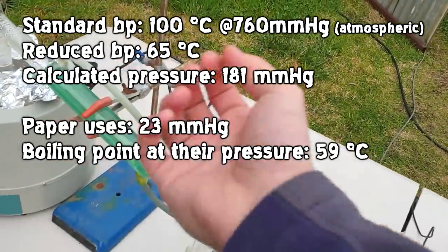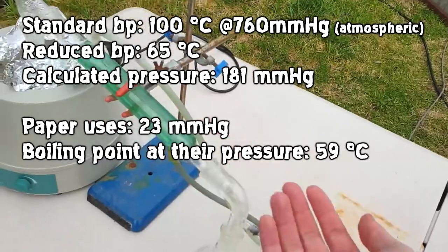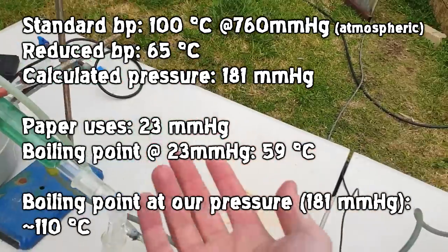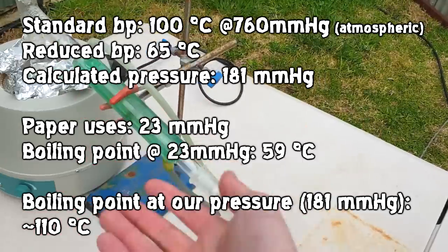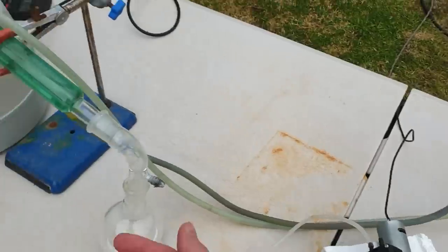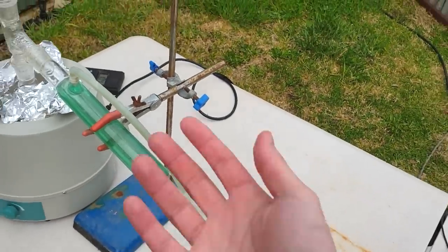So we can put those numbers into our system and ask what the boiling point would be at 181 millimeters of mercury. And we see that it's about 110 degrees, which is not too high. It's the temperature it's been subjected to during its Dean-Stark reflux anyway. Even though 181 millimeters of mercury is a lot higher than the pressure they're using, I still think we can get away with it.